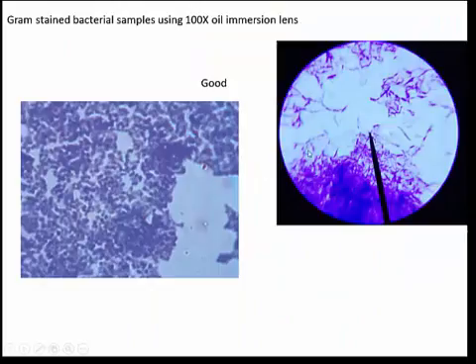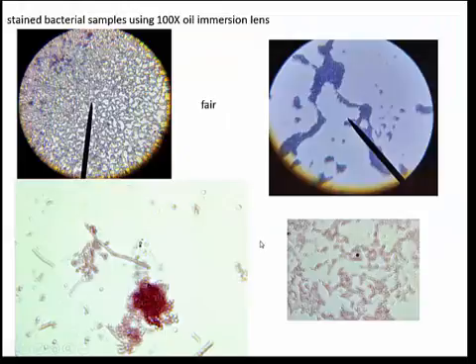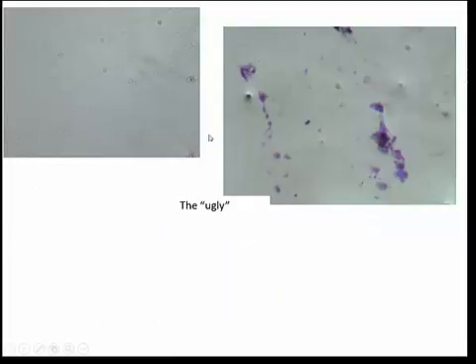If not, then perhaps something like this, right? Or like this, but definitely not any of this stuff right here.